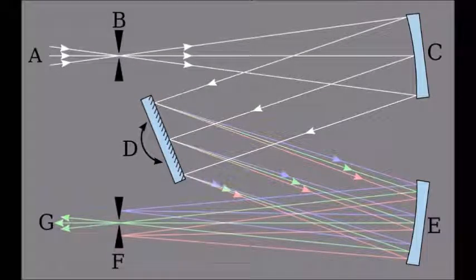After the excitation of elements in plasma, the electromagnetic radiation, which in this case is located in the ultraviolet region, should be resolved to its wavelength or frequency components. We use a monochromator with a diffraction grating for that purpose. As you see, the beam at the entrance slit contains all wavelengths combined in one beam, and at the exit slit the beam is dispersed. We can make the diffraction grating move to make all spectral lines pass through the exit slit to the detector, which gives the values of these frequencies and the intensities of the lines.